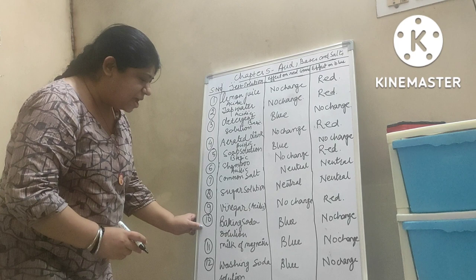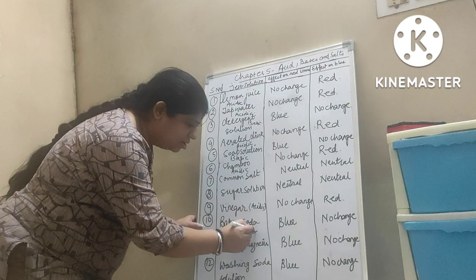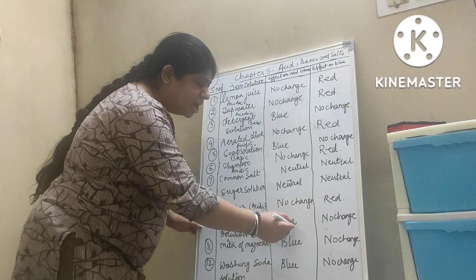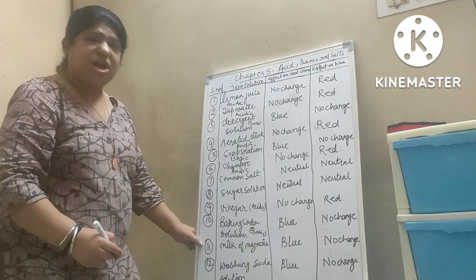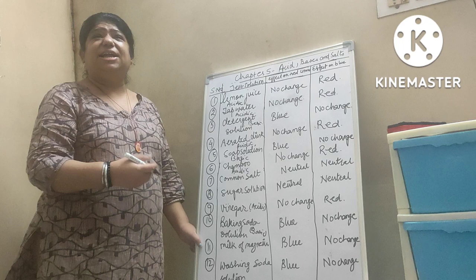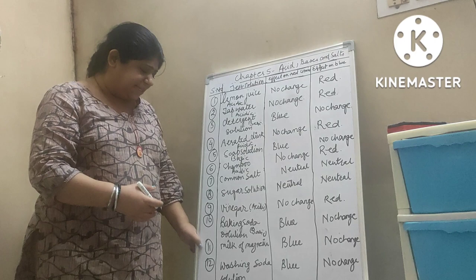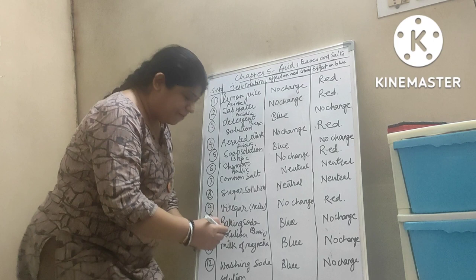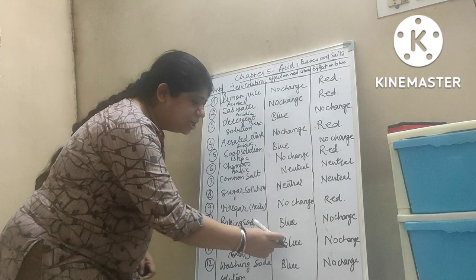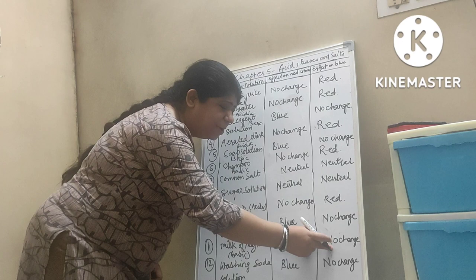Baking soda solution — as you know, this is also basic in nature. So red litmus paper will turn into blue and blue — no change. Milk of Magnesia: what is milk of Magnesia? It is used when you feel acidic — it is given as a medicine for acidity. We all know that it is basic in nature, so this will turn the red litmus paper into blue and in blue litmus paper no change.